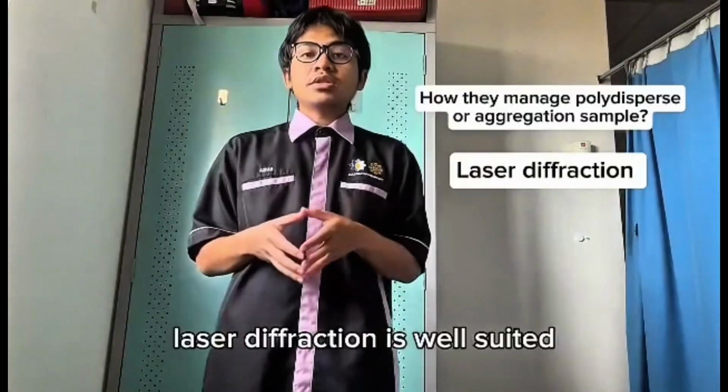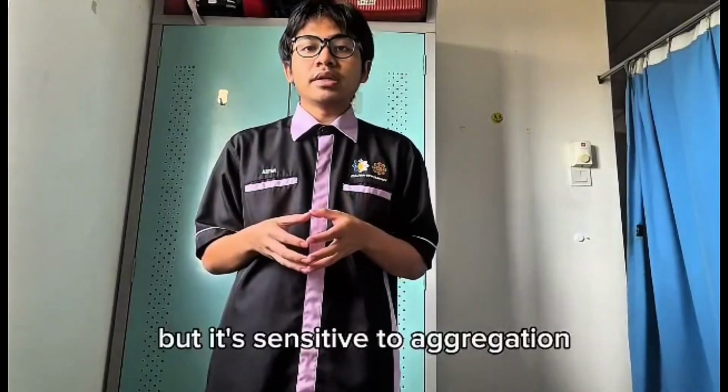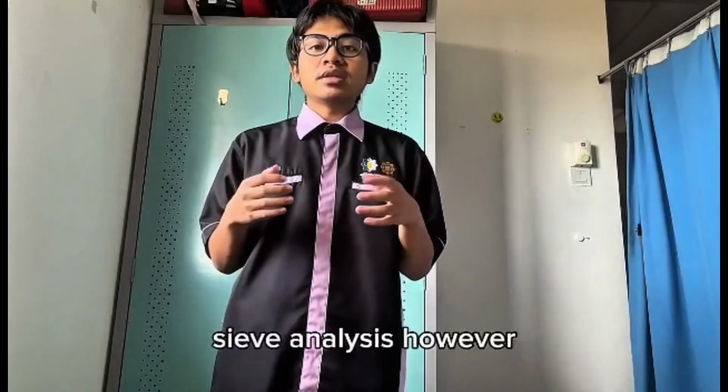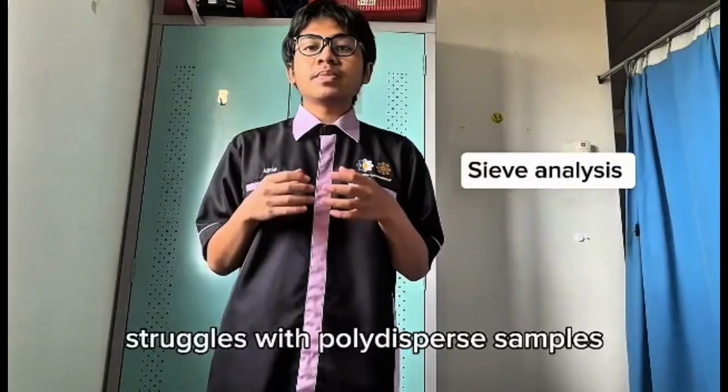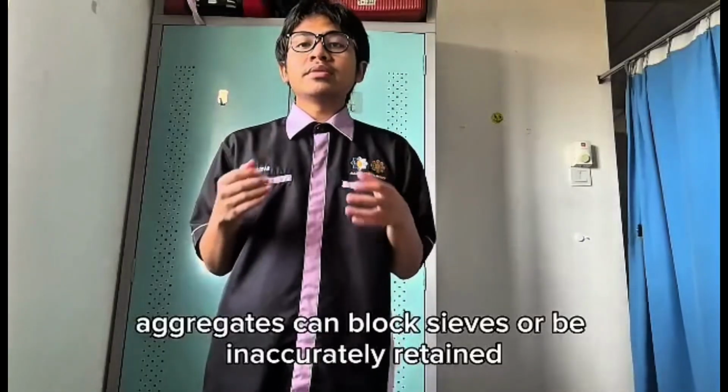Laser diffraction is well suited for polydispersed samples, detecting a wide range of particle sizes simultaneously, but it's sensitive to aggregation, which can skew the distribution to appear larger. Sieve analysis, however, struggles with polydispersed samples and is easily affected by aggregation. Agglomerates can block sieves or be inaccurately retained.